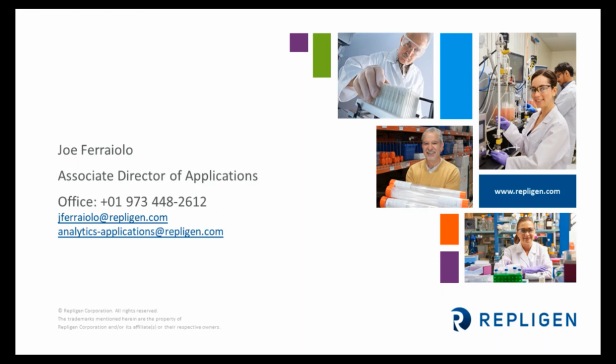What's nice about Solo VPE is that we don't care about absolute absorbance. What we care about is the change of absorbance. So the step motor of the Solo VPE actually has a plus or minus 1 micron tolerance, and the smallest step that we allow the Solo to take is 5 microns. So we're certainly well within the tolerance range of that. But even more importantly, it's that change of absorbance that we care about.